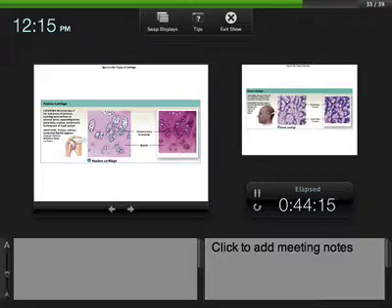And when you look at hyaline cartilage, you have all of this matrix here, which is not cell, okay? And then you have these lacuna, which are holes in the matrix with the chondrocytes in them, the actual cartilage cells living in them. Cartilage is a little bit like a sponge. It's compressible, it's bendable, and it comes back to shape because of all the collagen and the glycosaminoglycans and all that stuff that's in it.